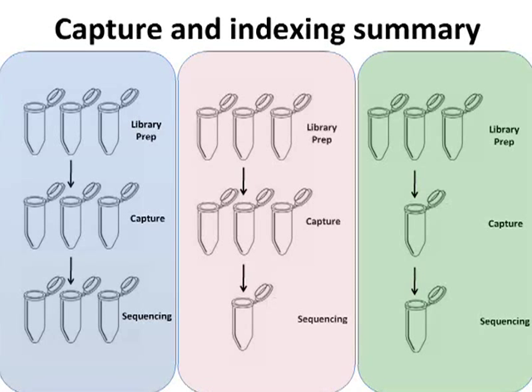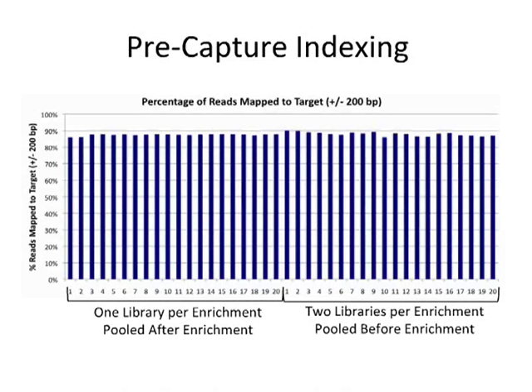What I'll illustrate in a moment is our current production methodology, which is library preparation in individual tubes, co-capture with a number of samples, gaining great efficiency both in reagent, but more importantly, in time and consistency, and then continuing on to sequencing. So basically, you're pooling post-library prep, pre-capture, doing a multiplex capture onto sequencing. And so in this case, this slide simply illustrates that pre-capture indexing.